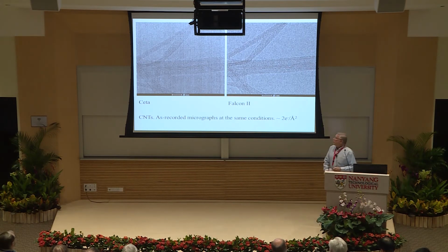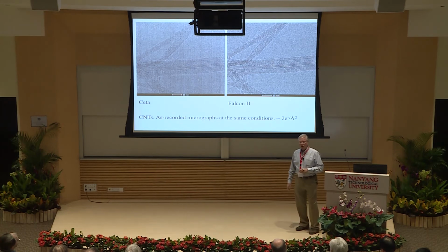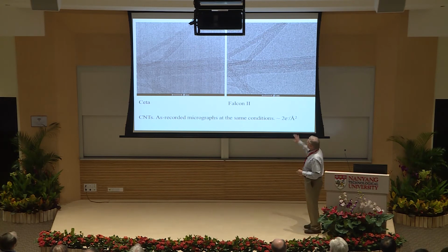The first thing is that we have much more sensitive electron cameras. And what you see here already comes from the new microscope. What you see here is the same specimen. This has nothing to do with the topic of our conference. These are dry carbon nanotubes, the same area taken with two cameras.